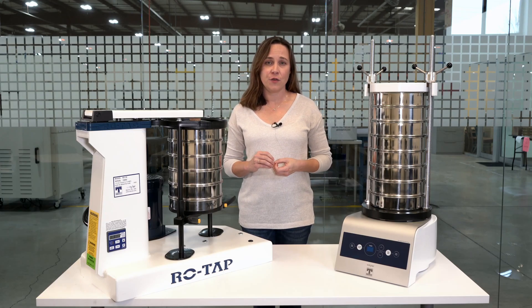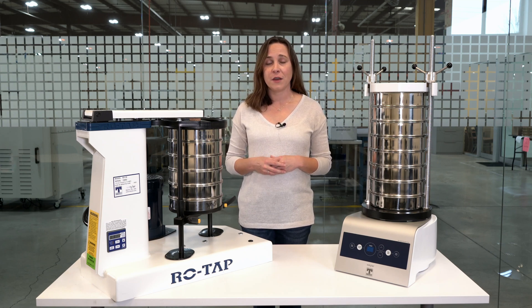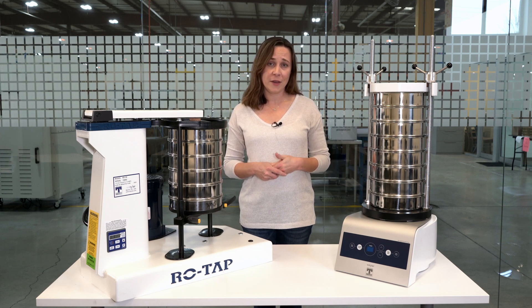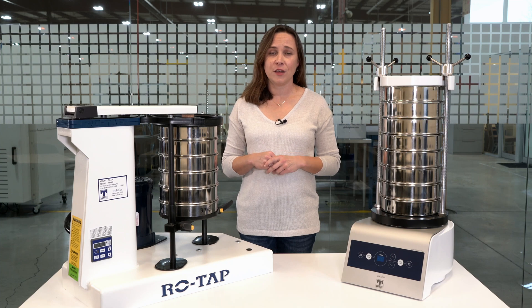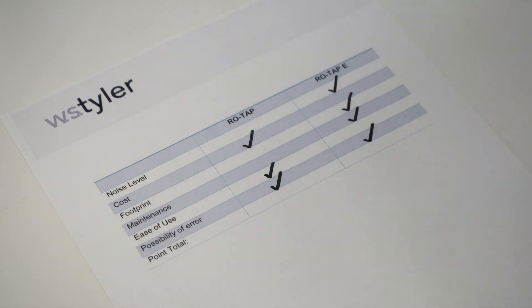Whichever version of the sieve shaker you choose, the first and most important step is running an end-of-sieving analysis so that you'll get consistent, repeatable results every time you run a test. There is some possibility for error if parts on the mechanical shaker wear down and need to be replaced, but inconsistent users are the main source of error in any sieve analysis process. So in this category, we're going to give both shakers the check mark.